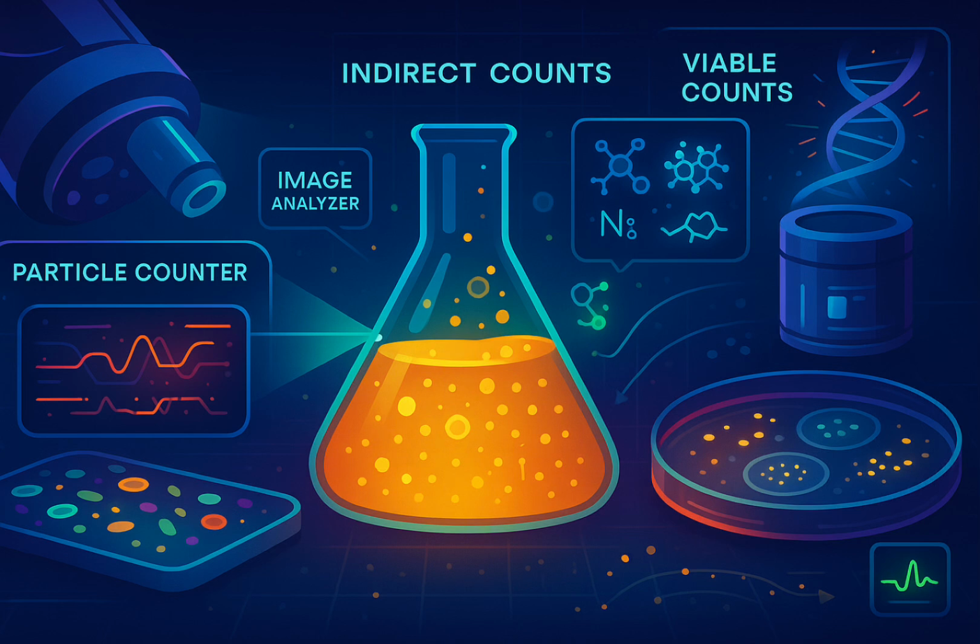Okay, so plating has major limits on telling us who's really alive. What about methods that assess viability without needing colony growth? Now we're talking things like the ATP bioluminescence assay. ATP, the energy molecule. Exactly. ATP is the main energy currency in active living cells. Dead cells lose their ATP pretty fast. You measure it with the firefly enzyme, luciferase. You add luciferase and its substrate, luciferin, to your sample extract. If ATP is present, the enzyme uses it to make light. More light, more ATP, more active cells.